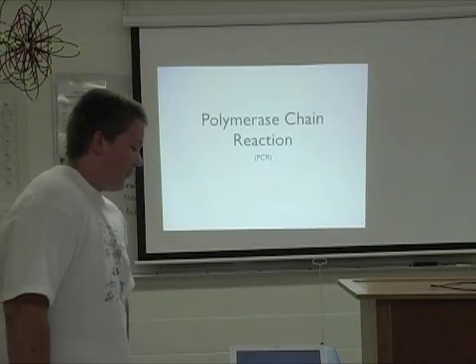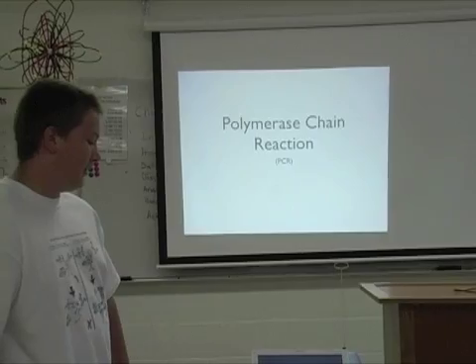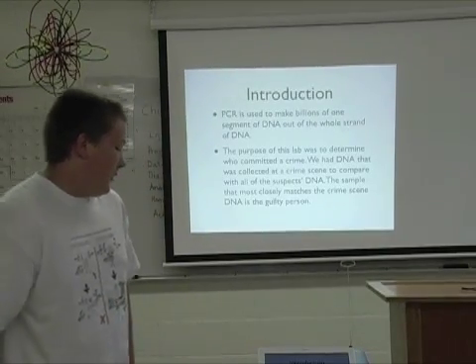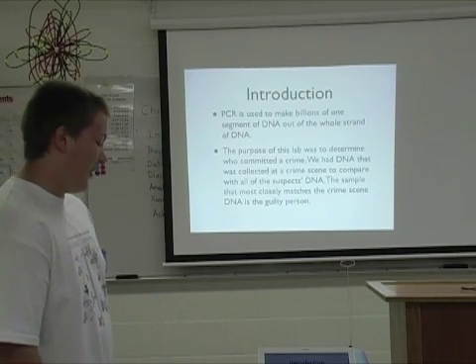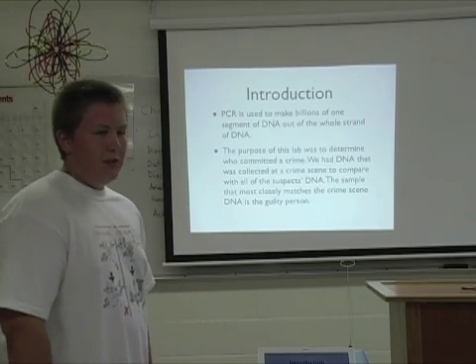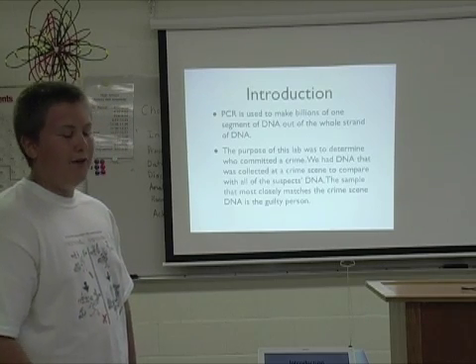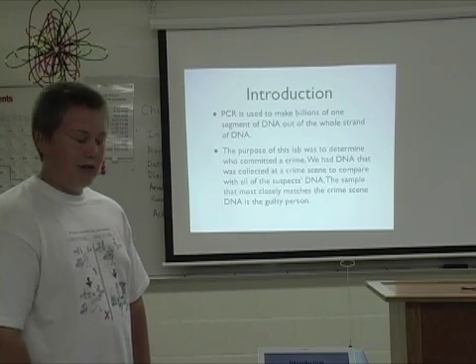I did my presentation on polymerase chain reaction, abbreviated as PCR. My introduction: PCR is used to make billions of one segment of DNA out of the whole strand of DNA that you're working with. And that just means that instead of taking a long time to get one segment of DNA, you can take it and make a lot of it at one time.